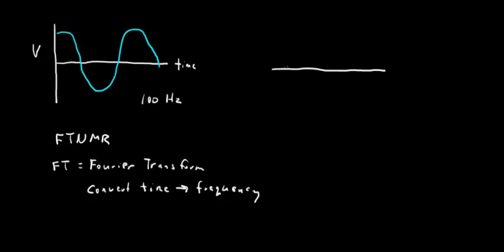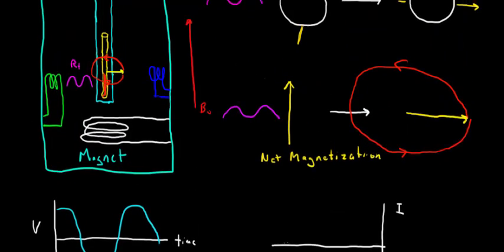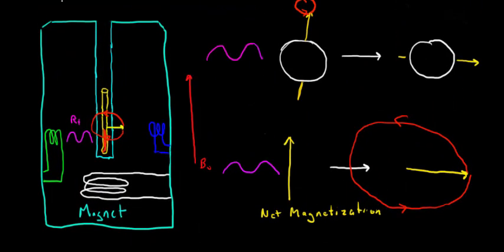So the intensity that we're talking about here is the amplitude of the voltage. Okay, and so this is intensity, y-axis, and the x-axis is frequency. So we're going to get a resonance, a peak known as a resonance, because this frequency comes from the Larmor frequency, when the applied RF radiation was in resonance with the Larmor frequency.